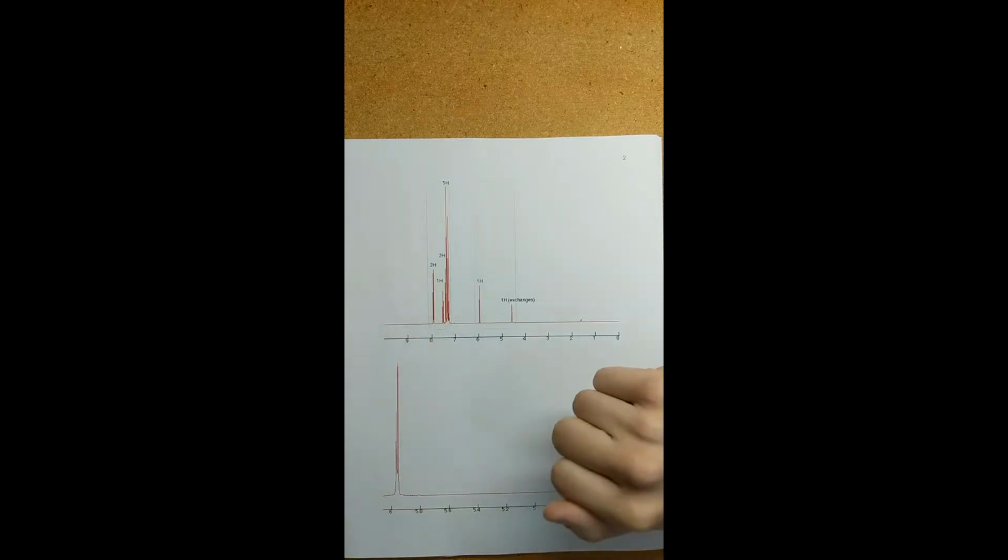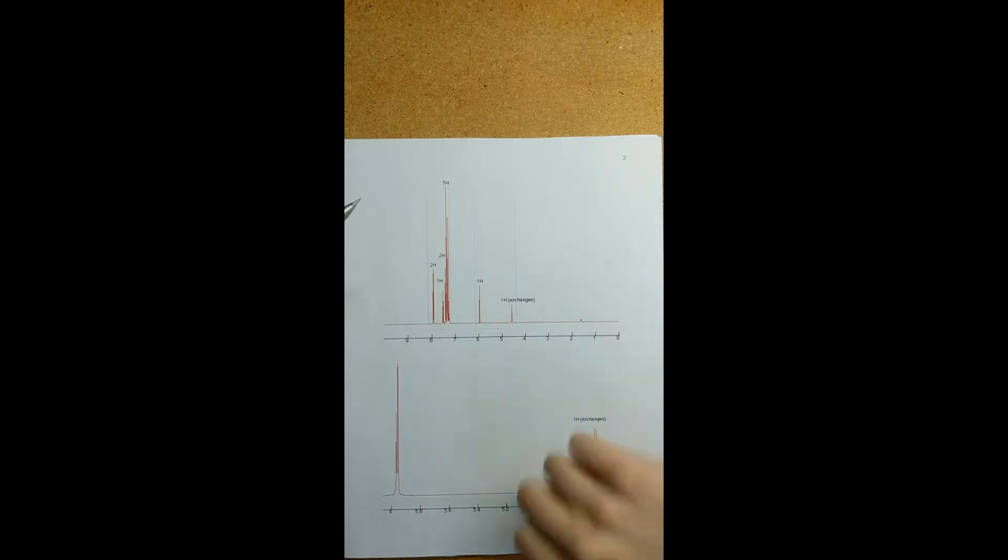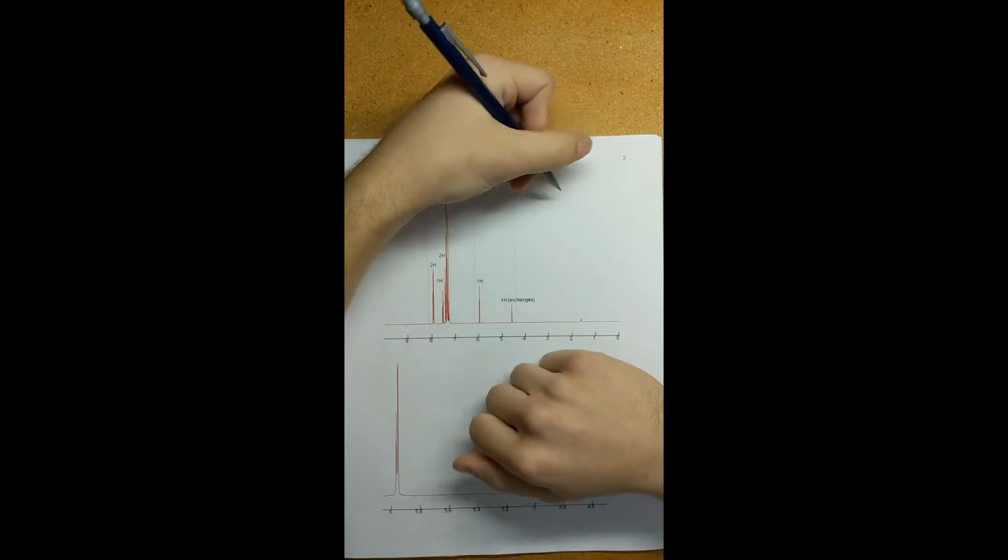So I have come up with a structure that I believe could fit this, and so I'm going to go ahead and draw that in for you now.